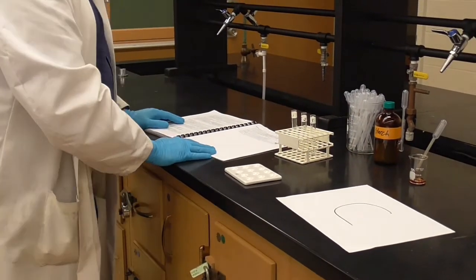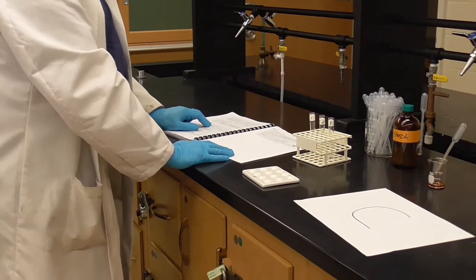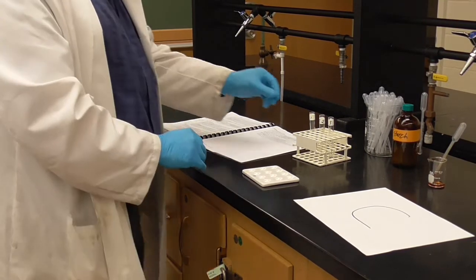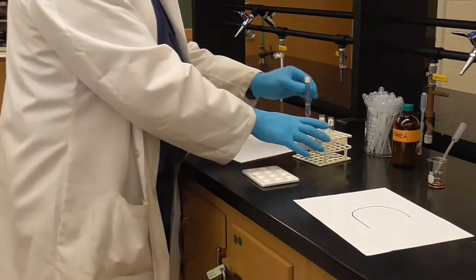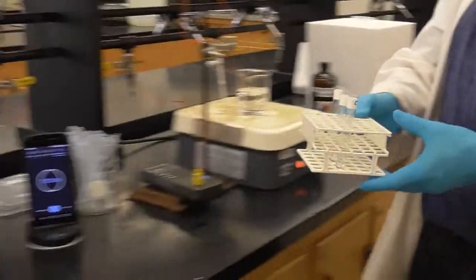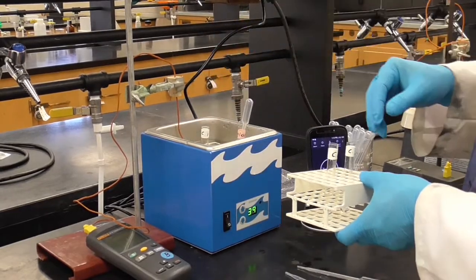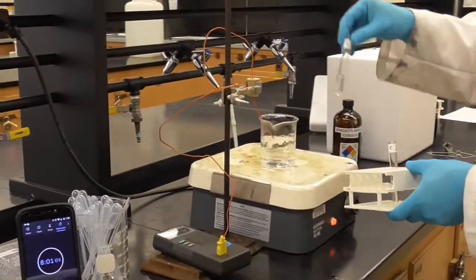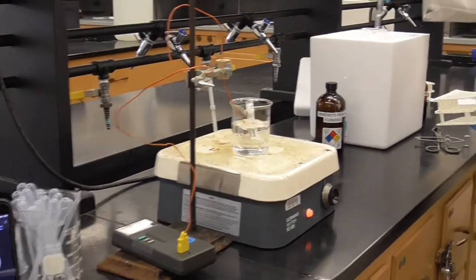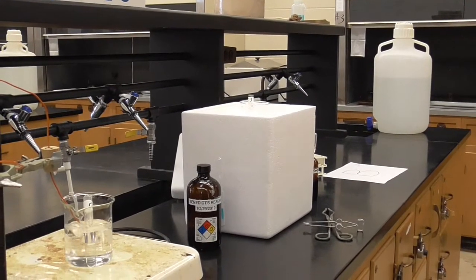Okay. It then says place 1 tube in the boiling water, place 1 in the 37, and 1 in the ice bath. All right, so the first one again at 37. Let me just bring the whole rack over to this side. Okay, so test tube number 1 at 37 degrees. Test tube number 2, boiling. Test tube number 3 in the ice bath. There we are. And so those are the 3 temperatures we are testing.